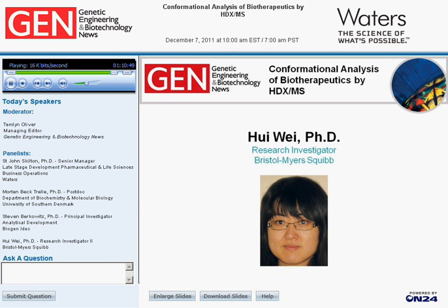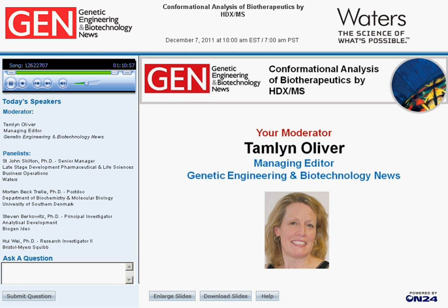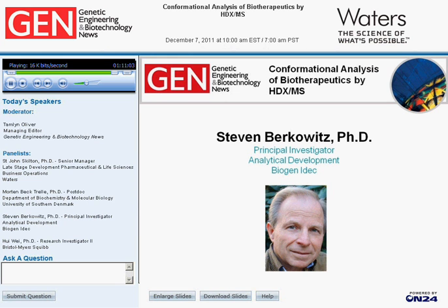Thank you. Steve, another question. Why do HDX studies use so many time points? Well, I think the realization is there's a lot of dynamic properties going on in these molecules, and there are people who do single point measurements to get data, but clearly there are kinetic processes related to the exchange of the various amide protons, and you need a wide range of data to cover that, and that's all important information.